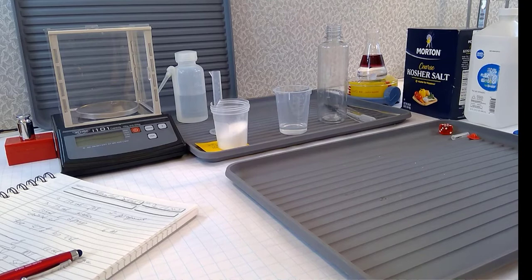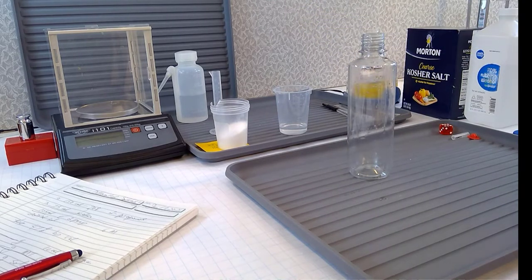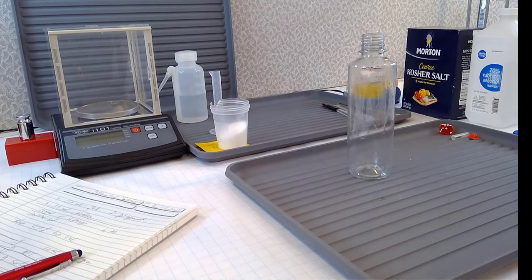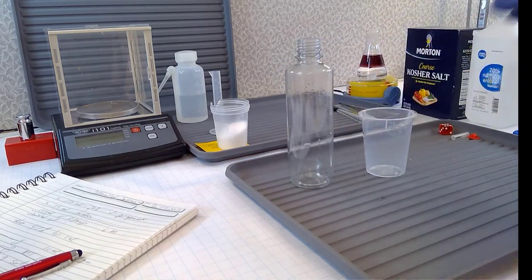We're going to start off by getting 150 mLs of this 70% stuff. I've got my little plastic beaker with some approximate markings on it.